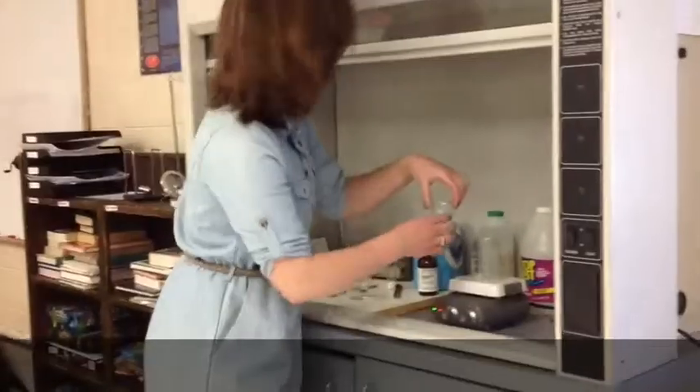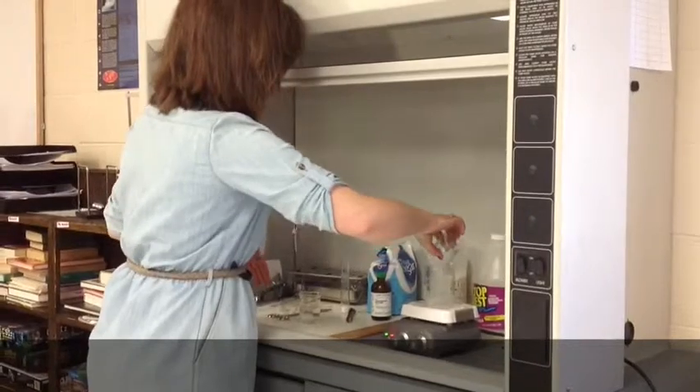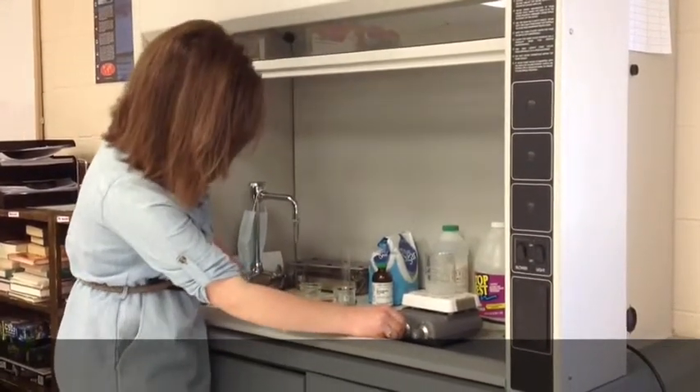To begin this experiment, add your silver nitrate to the beaker above the hot plate. Turn the hot plate to about 4 with the magnetic stir bar in there. You want to turn up the stir to about 4 as well.